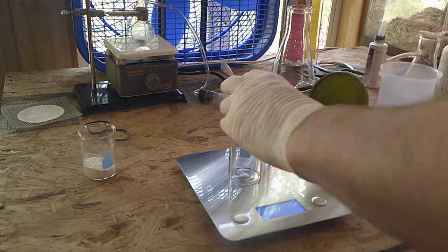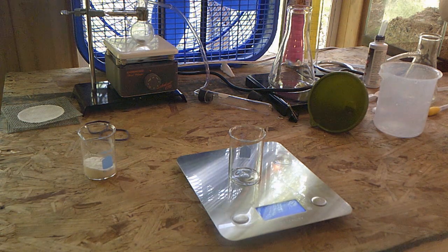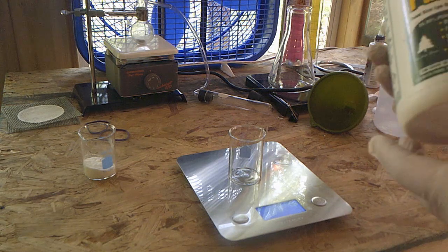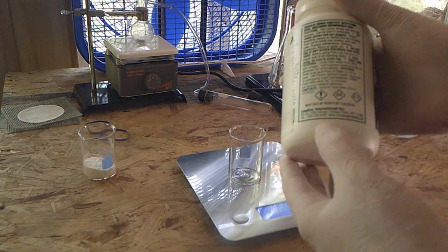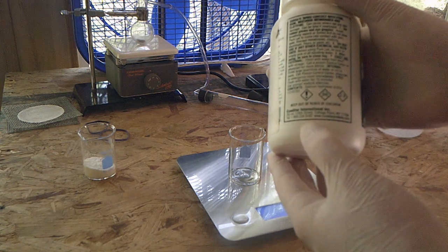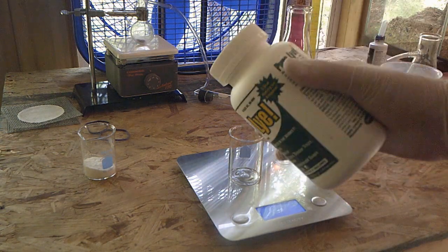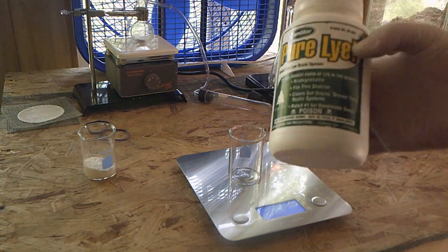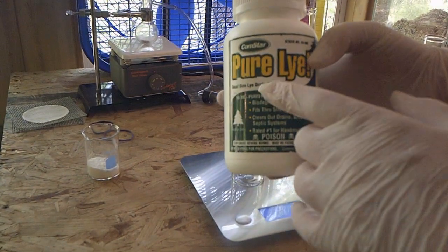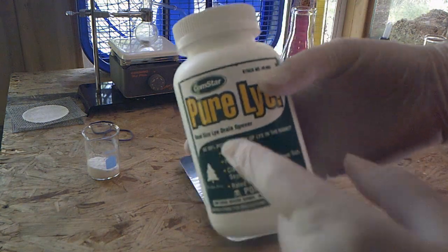Now this next chemical that we're going to use, this is the dangerous one, and this is why I'm wearing gloves. So we're going to be using lye. And lye is an extremely strong base. So we've talked about acids and bases. And this one's not an acid, this is the opposite. So this is a base, but this is a very strong base. I'm going to be wearing gloves to protect my skin. This is a chemical we use to make soap because it's used for dissolving organic compounds. And because it's so good at dissolving organic compounds, we also sell it and use it as drain opener, right? Because it dissolves hair and gunk that's left in your drains.